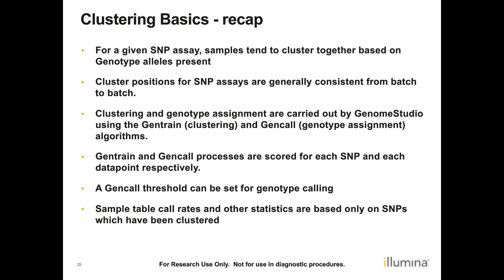A GenCall threshold can be set for genotype calling, where samples above the threshold get called, samples below the threshold do not get called. Finally, sample table call rates and other statistics are based only on SNPs which have been clustered.